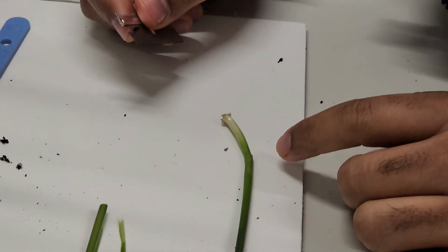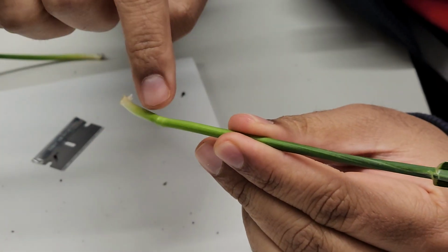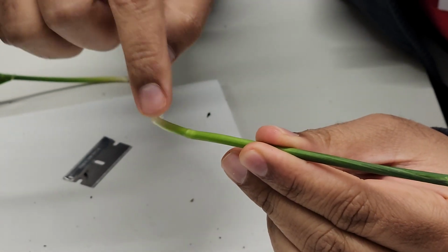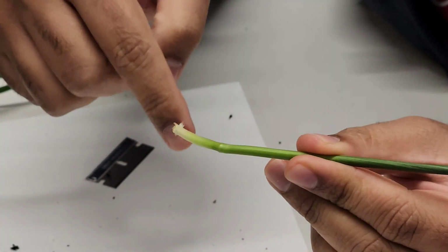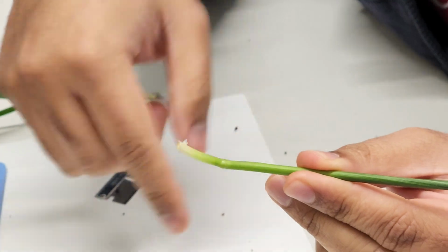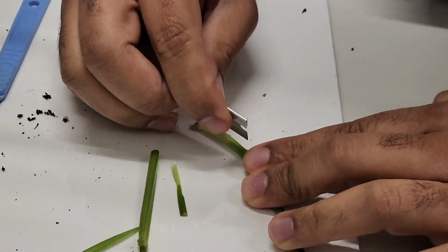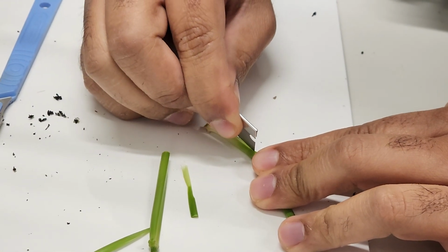Let's do some sectioning to find out. Where I should have brought my regular scalpel. Anyway, just now I said that the meristem should be above the internode, but for rice, usually the meristem is in the white region. Maybe the same law doesn't apply. I don't know. Let's see whether we can get the meristem here.